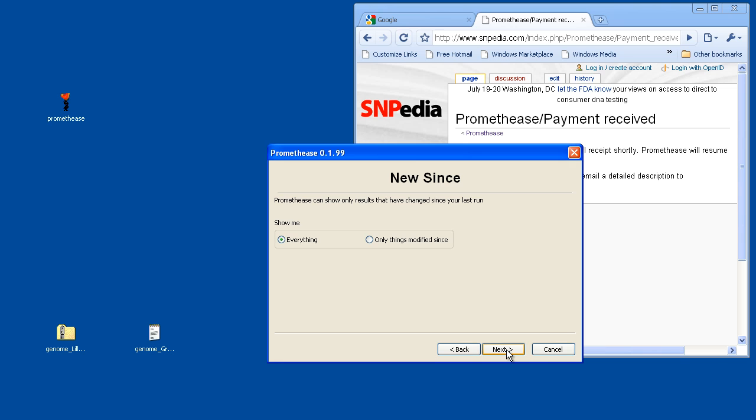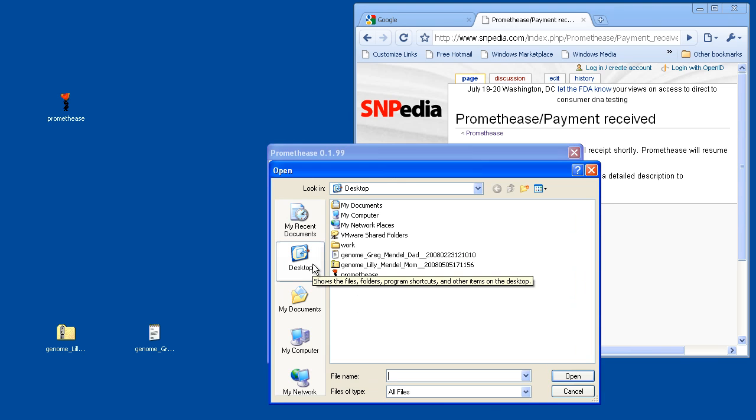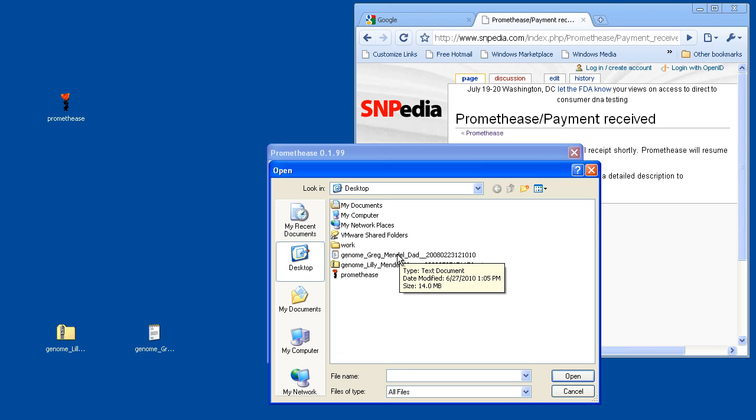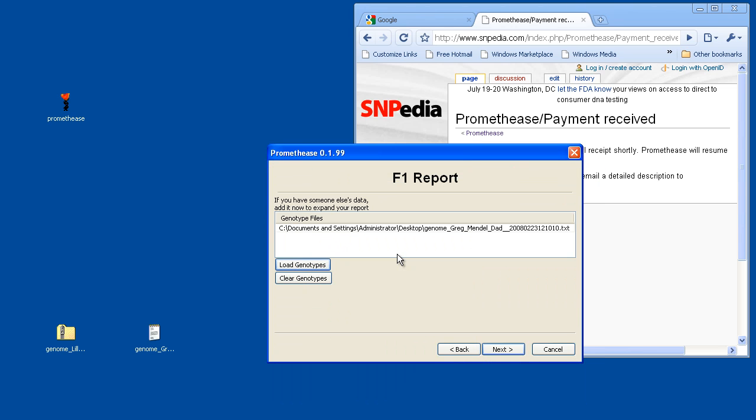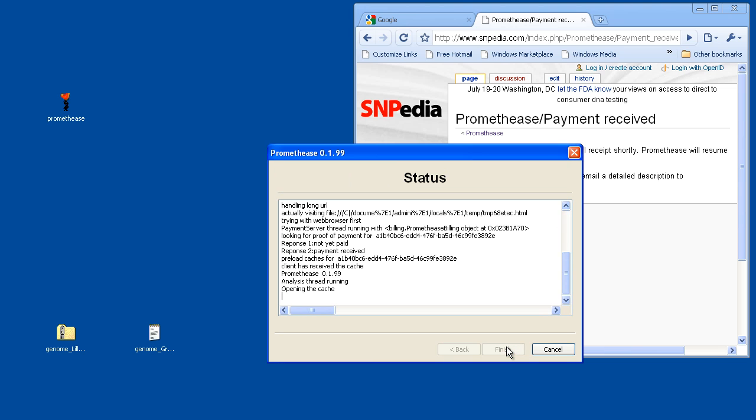We're going to say Next and just choose Everything. Now we're going to add a second report. This report instead is from the Greg Mendel genome. And with the F1 reports, we can do a couple different comparisons between these two genomes. And so now I'll click Next, and then one more time to begin the analysis.